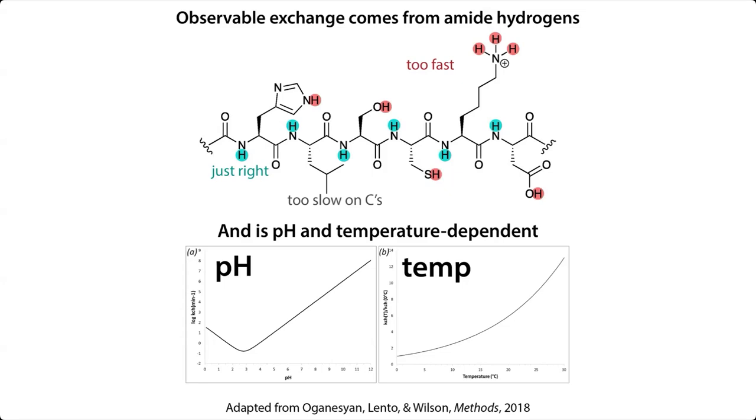Imagine you have a race and you want to see what places different people in the race finish, but you don't have a camera you can constantly monitor the race. And so you want to choose a few different times in which to take a picture of the finish line and see who's crossed it. If you were to wait and take it like an hour after the race, that wouldn't be very helpful because everyone would have gone through and you won't be able to tell what order they came in. If you went too soon, well, now you wouldn't see anything. So you want to kind of space things out so that you can get the best sense of the order in which people arrived.